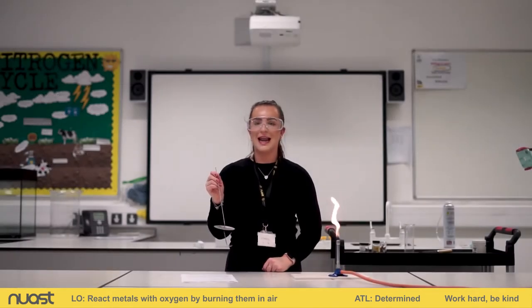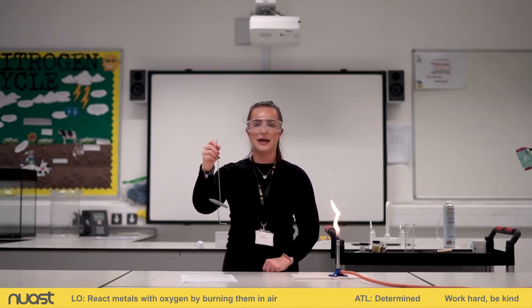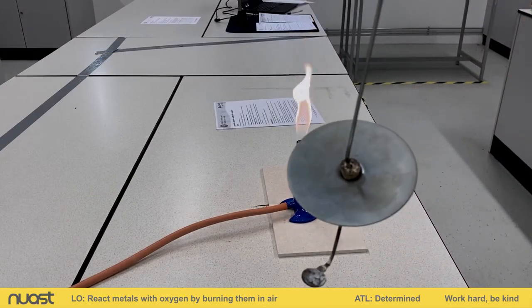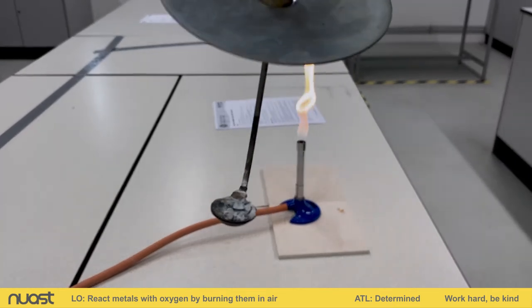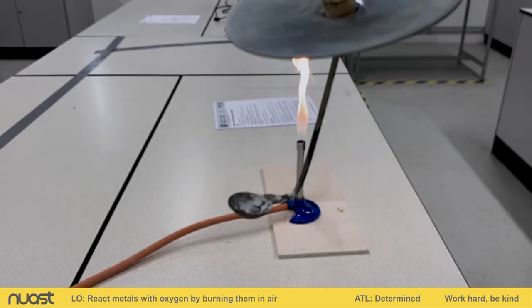Okay, so we're going on to our last metal now and we're going to be looking at calcium. So it's the similar type of apparatus as the magnesium one. So I've got my spoon, if I hold it up to the camera, you can see I've got granulated calcium here. So it's like little sections of calcium. So it's not one ribbon like the magnesium was, it's been split up in smaller bits.